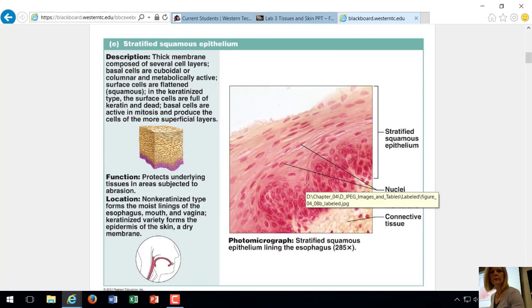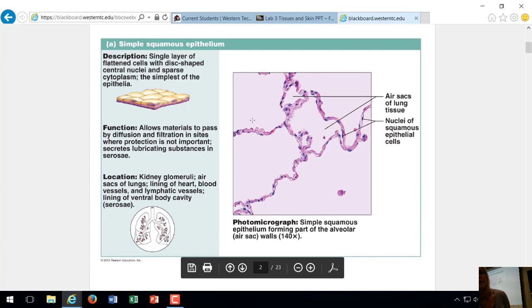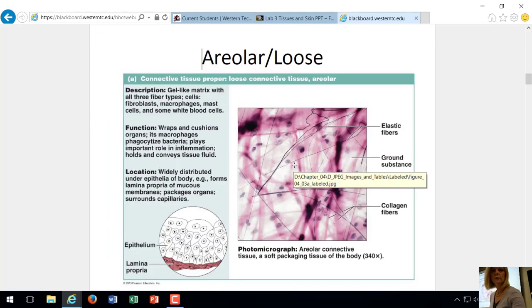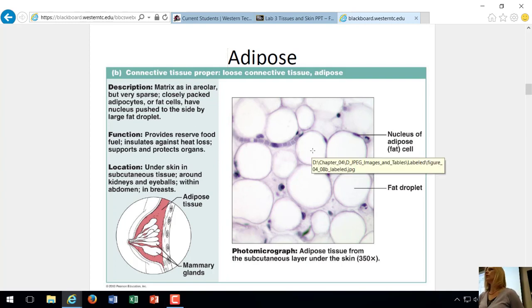Some people will confuse it with simple squamous tissue, but if I look at this, I do see open spaces, but are they rounded or uniform in shape? No. These are air sacs of the lungs and the simple squamous is found around the edges. Don't confuse simple squamous with adipose because they're very different tissues. Here I see smooth edges. I don't see cells around the edges. I see one nucleus and then this large cell with a big liquid fat oil droplet on the inside. That's adipose.